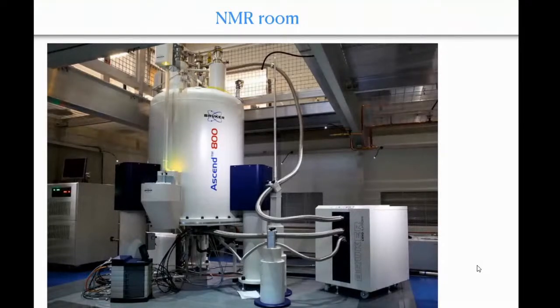You see a lot of wires going in. This is a cryo probe, and there is a cryo platform around here, but forget about the cryo platform. This is called a pre-amplifier. We'll come to all of this. This is a spectrometer, where all the pulsing, receiving, and everything happens. Of course, somewhere else there should be a person sitting with a computer, which will control everything. So a computer connects to the spectrometer. The spectrometer then connects to the probe, which is going in. There is also some connection to the magnet, but that is only for monitoring purposes.